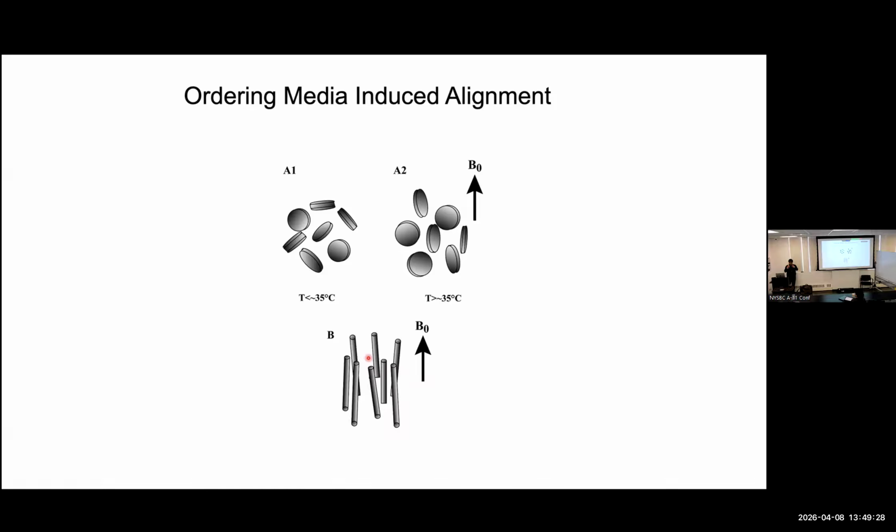If you have a sphere, it's never going to align, because its shape is isotropic. But even a small deviation from isotropic shape will cause a preference for alignment. Not only that, it's a preference that one can calculate rigorously by simply drawing a wall and doing this type of thing.